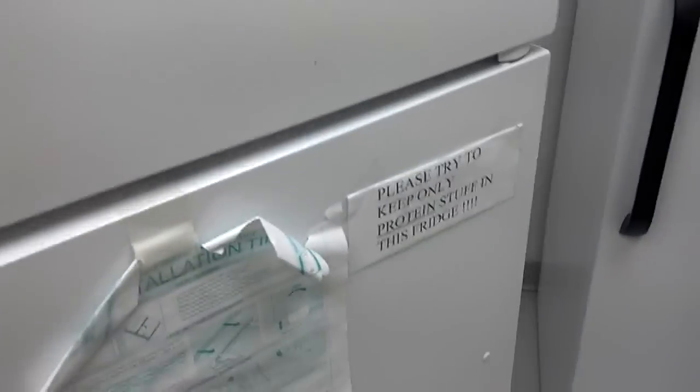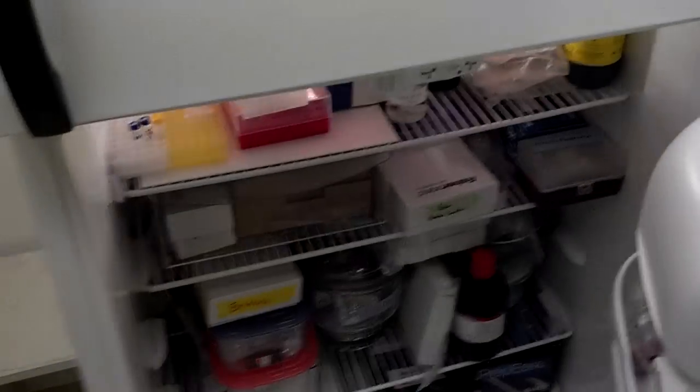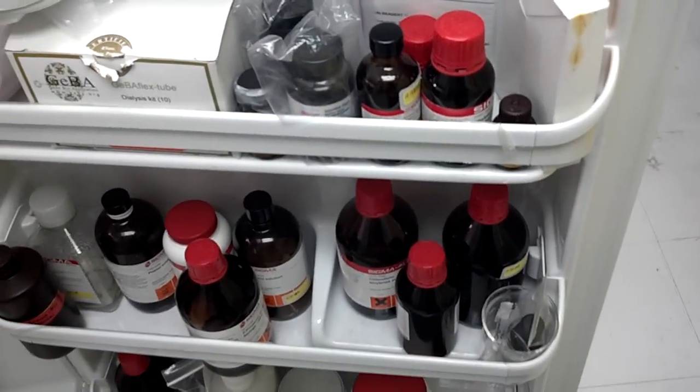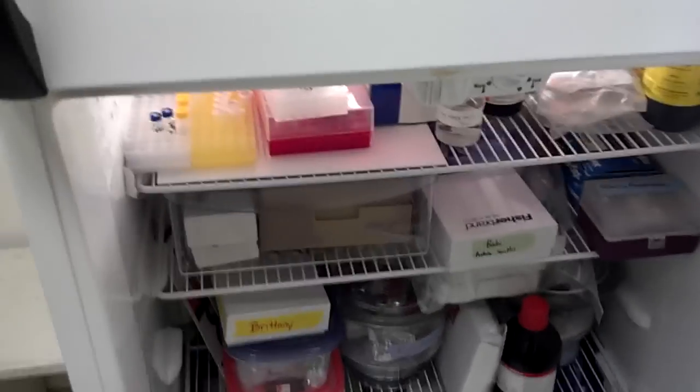It's the refrigerator where we keep the stuff used for lysing cells. We lyse the cells and take the DNA and RNA out of bacteria cells. Not eukaryotic, prokaryotic.